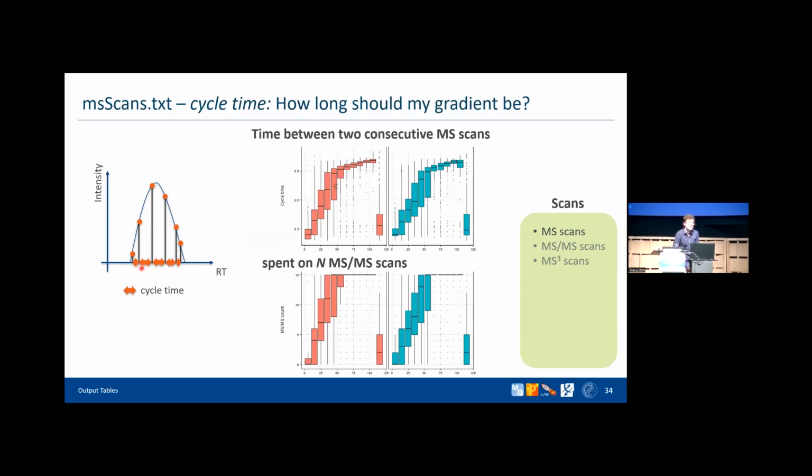So of course it needs some time to go to different peaks. So the question is, when does it get back to the same peak, to basically be at the same peak in the mass over charge axis, but be further down in the retention time axis?